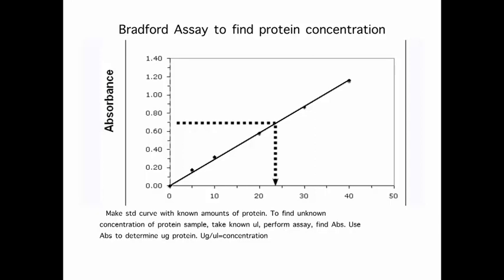After you purify your protein on the phosphocellulose column, you're going to save a third sample. After you run your protein on the gel exclusion column, you're going to save your pooled fraction, all of your proteins together that were your aldolase coming off the column. You're going to save that as S4. So you're going to have 4 samples that are going to be able to measure the progress that you made in being able to isolate aldolase.